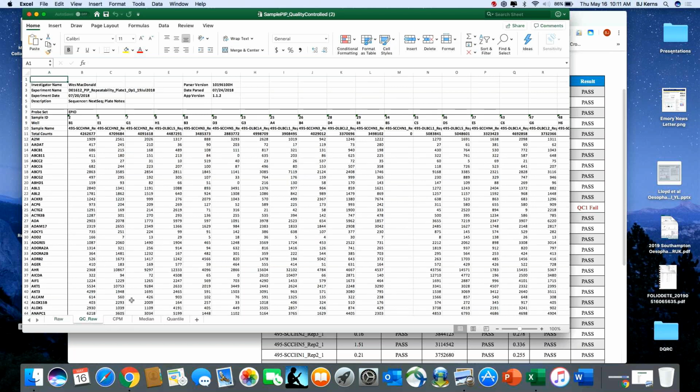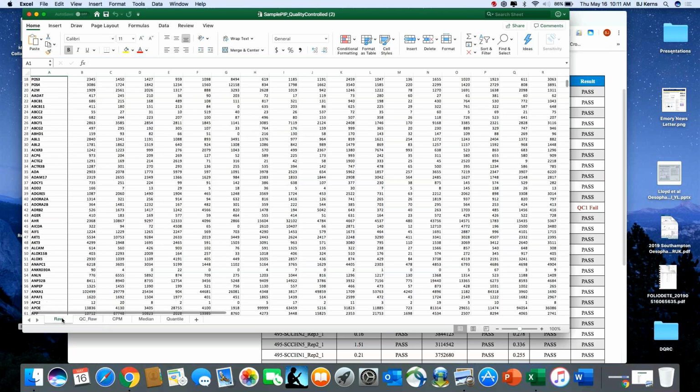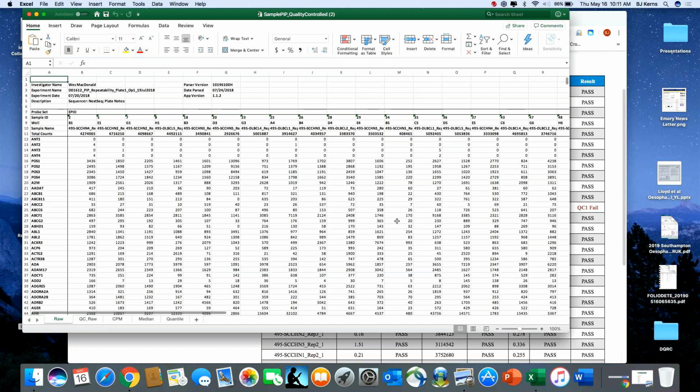It's going to show you what the data is from a QC raw. So basically, if you have a sample that failed QC0, QC1, or QC2, that data is then omitted from the QC raw because there's thought to be a flaw associated with that data. Now, if for some reason you look at the data and you say, you know what, it was pretty close, I think I'm going to count it anyway, you can always go back to the raw data. The raw data is still there. It didn't erase the data. It's just we're not going to carry it through our pipeline going forward.